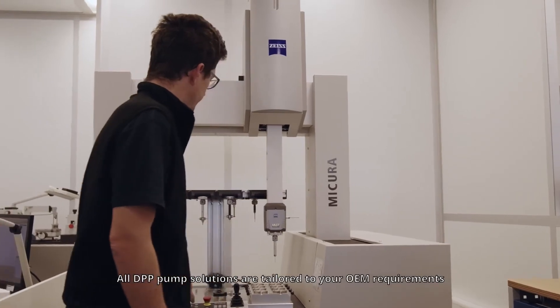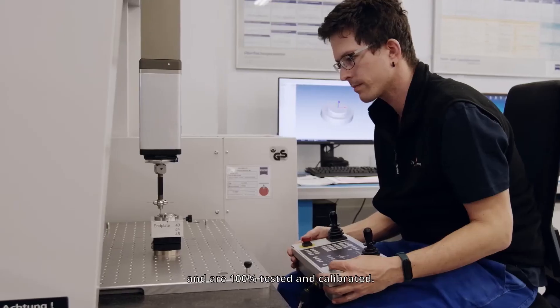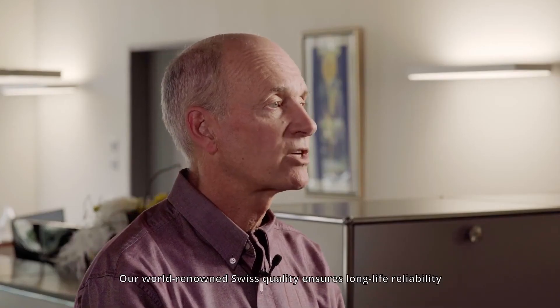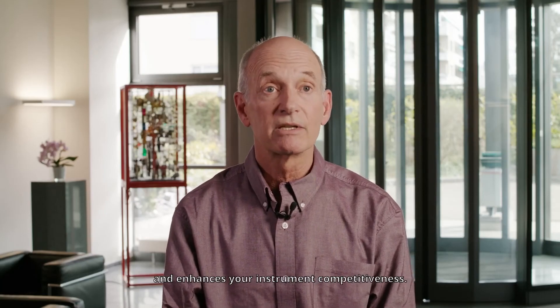All DPP pump solutions are tailored to your OEM requirements and are 100% tested and calibrated. Our world-renowned Swiss quality ensures long-life reliability and enhances your instrument competitiveness.